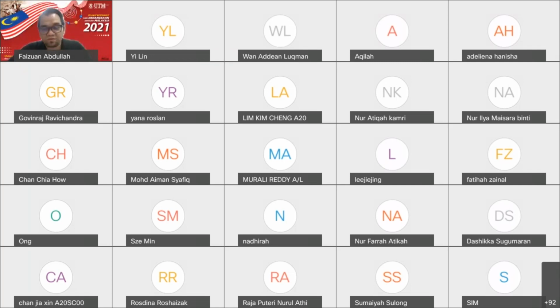After we calculate M1, V1, M2, V2, you need to take 10 mil. Thank you, Nadia, Azida, Aisha, and Sue for calculating it. So I take 10 mil from 1000 ppm and transfer it into the 100 mil volumetric flask.